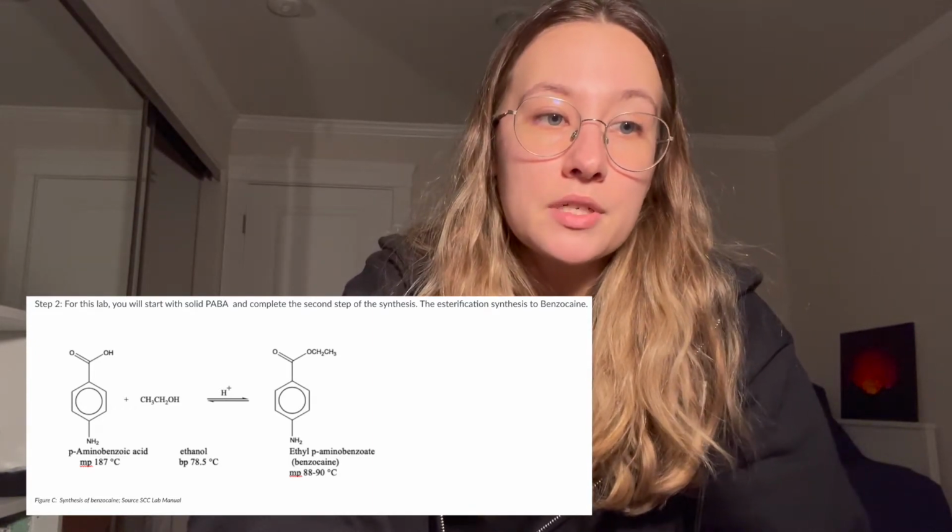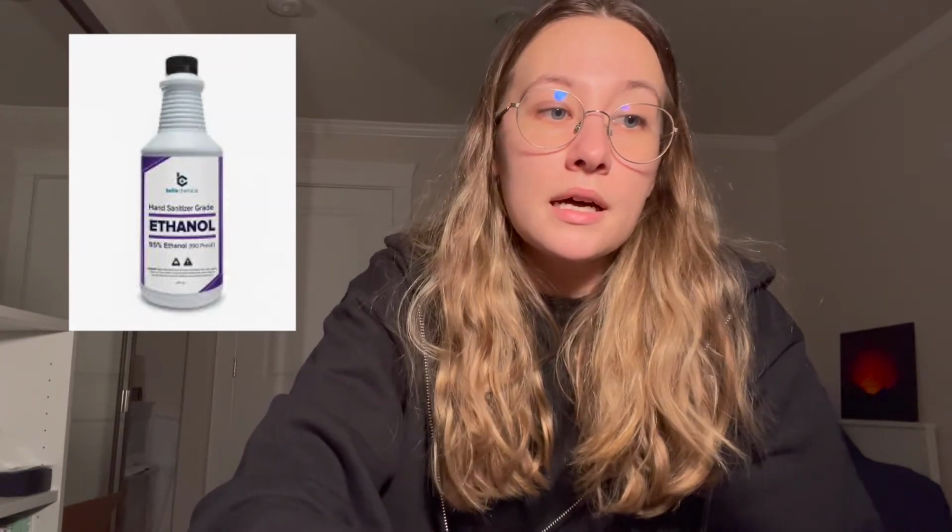In order to synthesize benzocaine from PABA, a Fischer esterification reaction is required. Fischer esterification is the esterification of a carboxylic acid by heating it with an alcohol in the presence of a strong acid as the catalyst. In the experiment performed, ethanol, 95% v/v, was used as the alcohol.